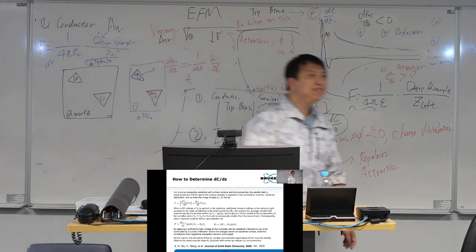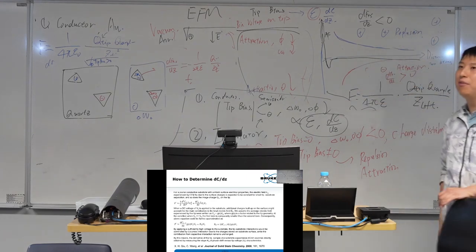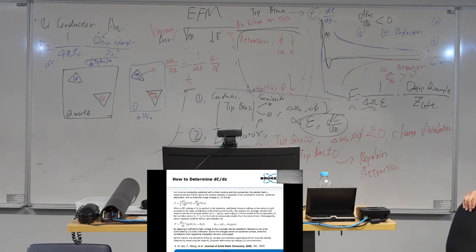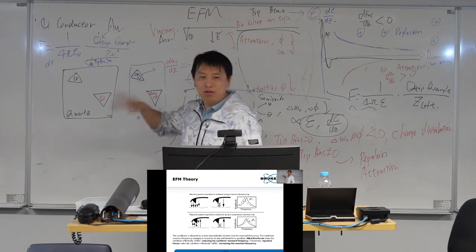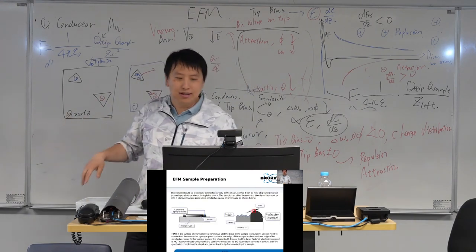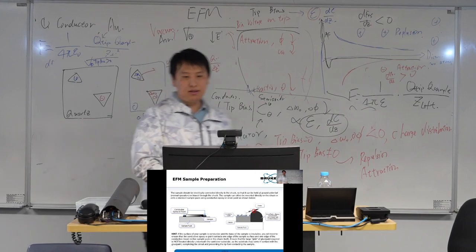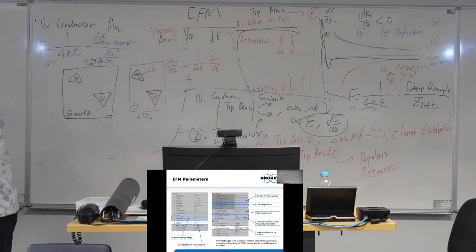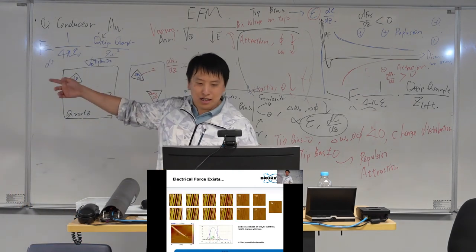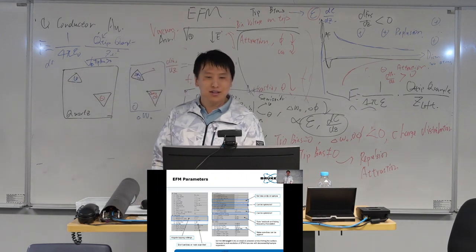Okay? Right? That's the whole idea. That's the whole idea of the EFM, and that's how we use the EFM for our studies. Okay, I think that's the whole story of the EFM. All the next, they are just more things to explain how it works, and there are some details, and those details we will go through in the hands-on session in the afternoon. How to adjust the parameters, I will show you in the afternoon's hands-on session.